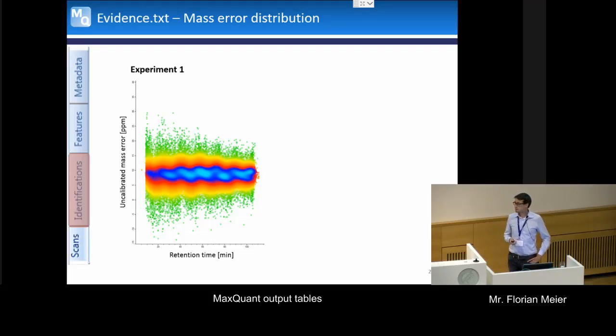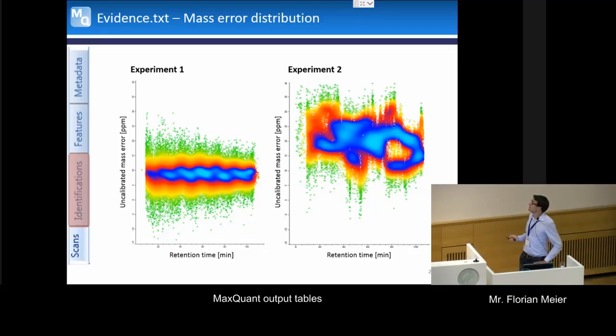because this can all be recalibrated. So let's say this was your run on Friday night, and then you check another run from Saturday morning, for instance, and then it looks like this. Immediately you see that something went wrong in this experiment. This could be because of the air condition or some other instrument failure. And it's just 2 clicks to figure this out and track down the problem in your runs.